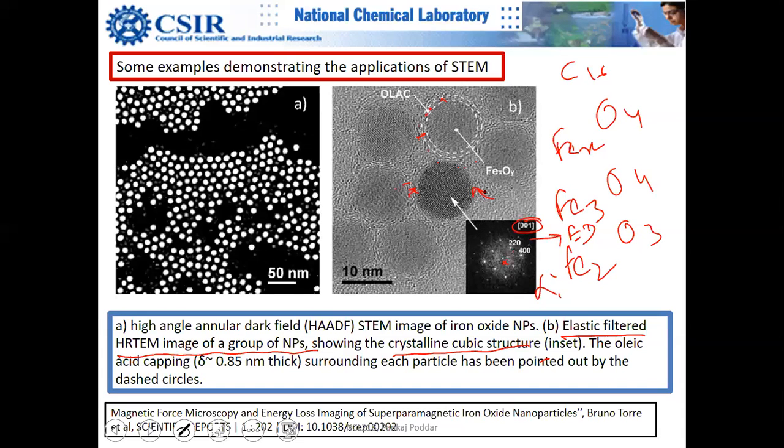When I say atom, please be careful. I have already said that you do not see atoms, but in layman language we say these are atoms. In pure physics terms, there is nothing called an atom. It's just a collection of particles. What we see is basically the image of Coulombic interaction, the potential distribution.